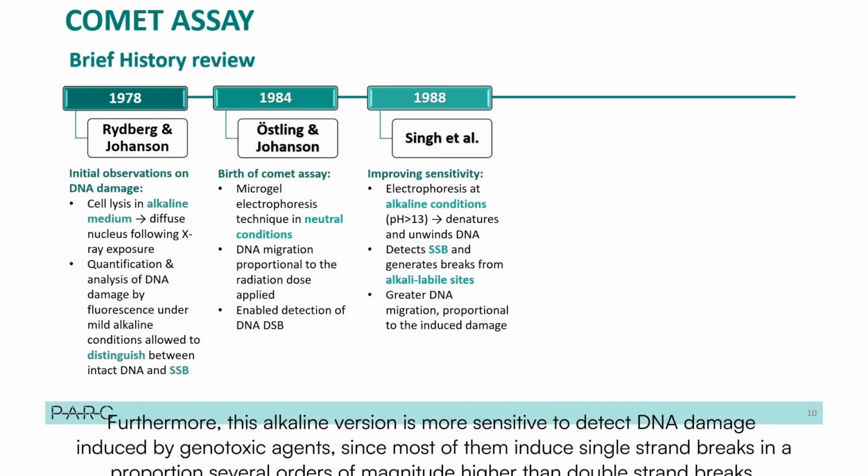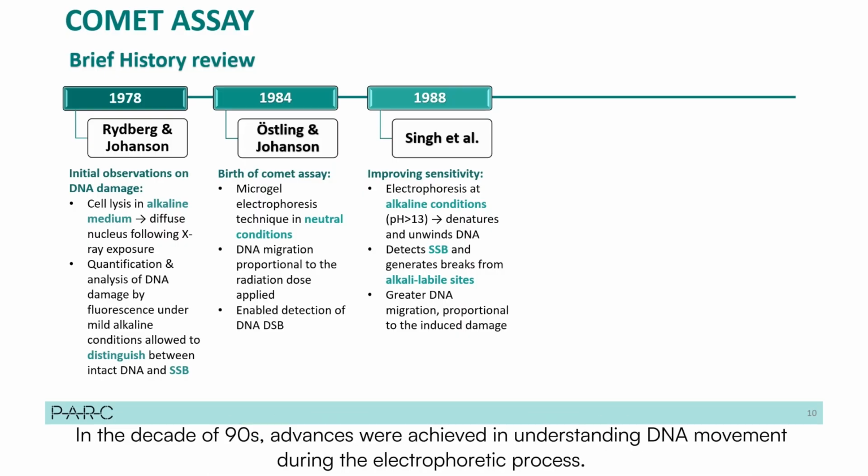Furthermore, this alkaline version is more sensitive to detect DNA damage induced by genotoxic agents, since most of them induce single-strand breaks in a proportion several orders of magnitude higher than double-strand breaks.